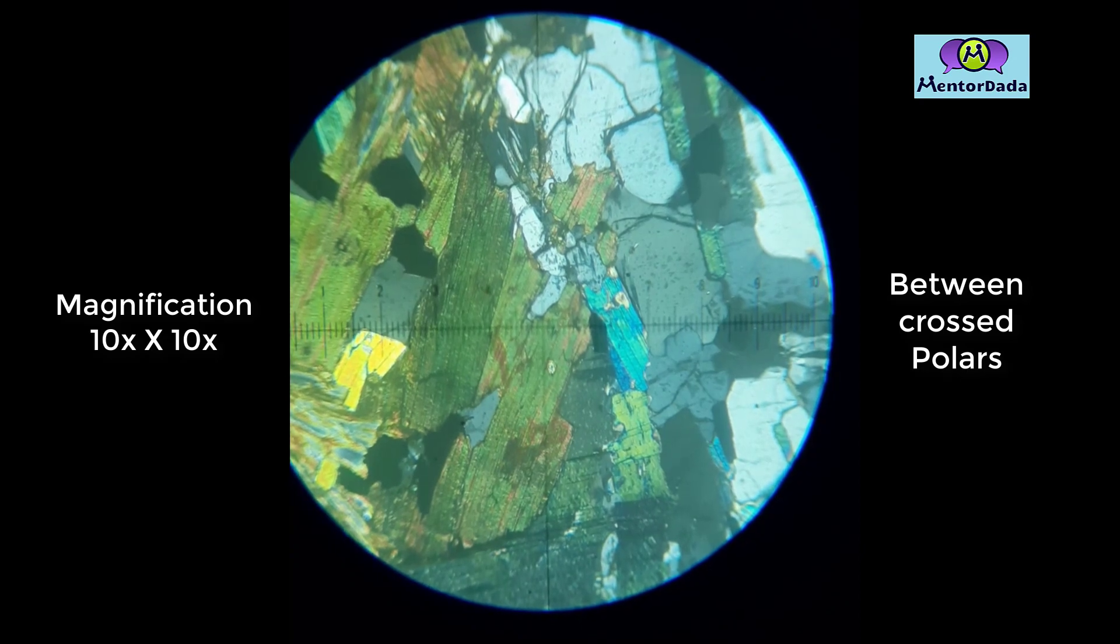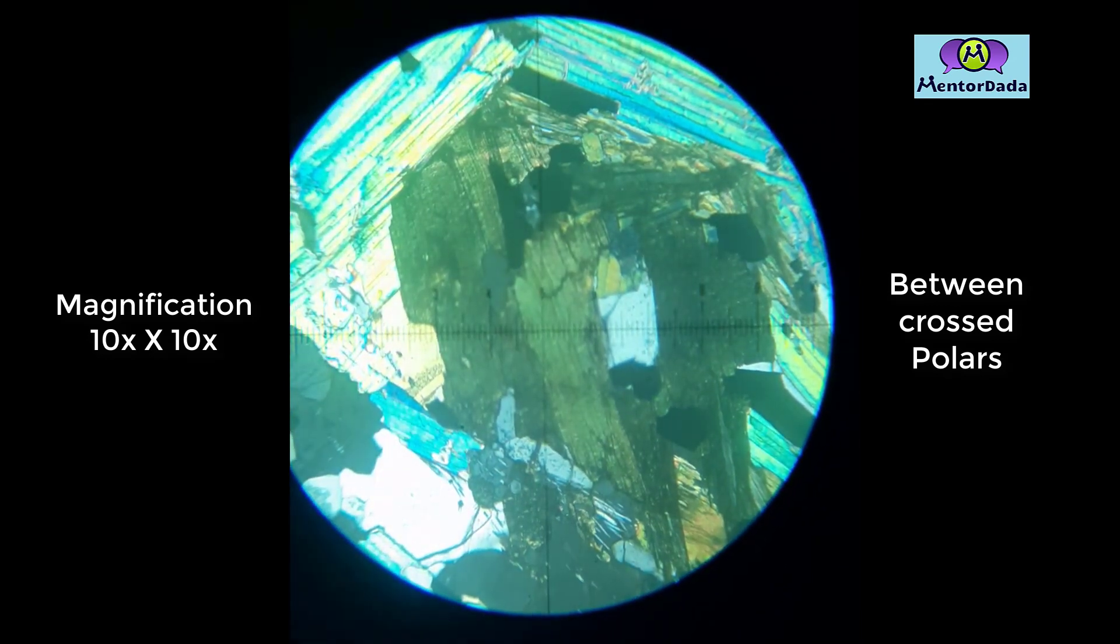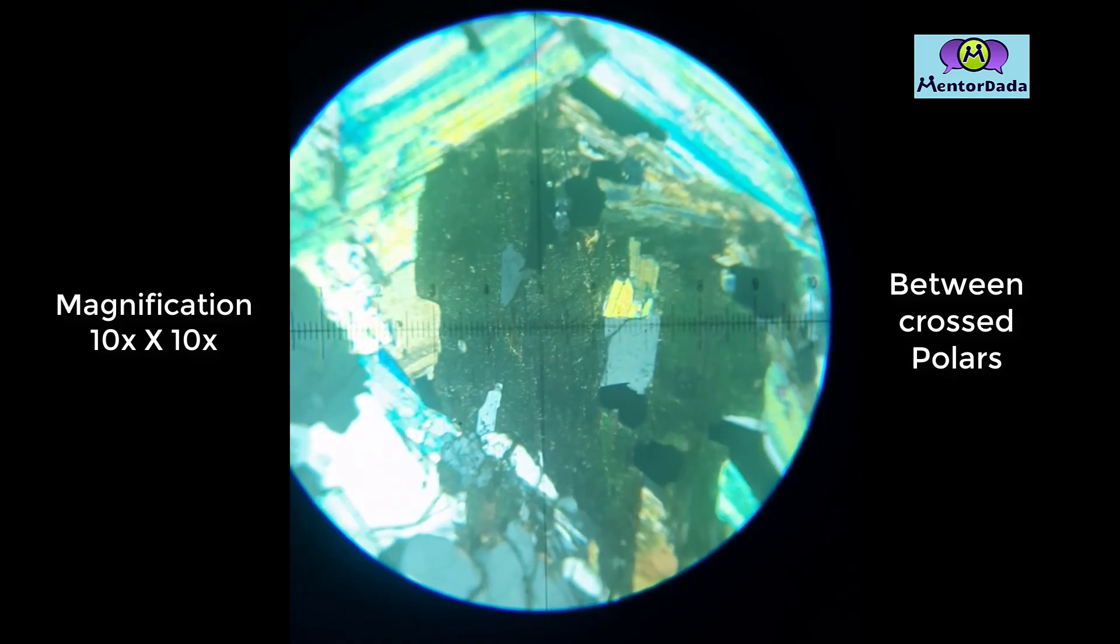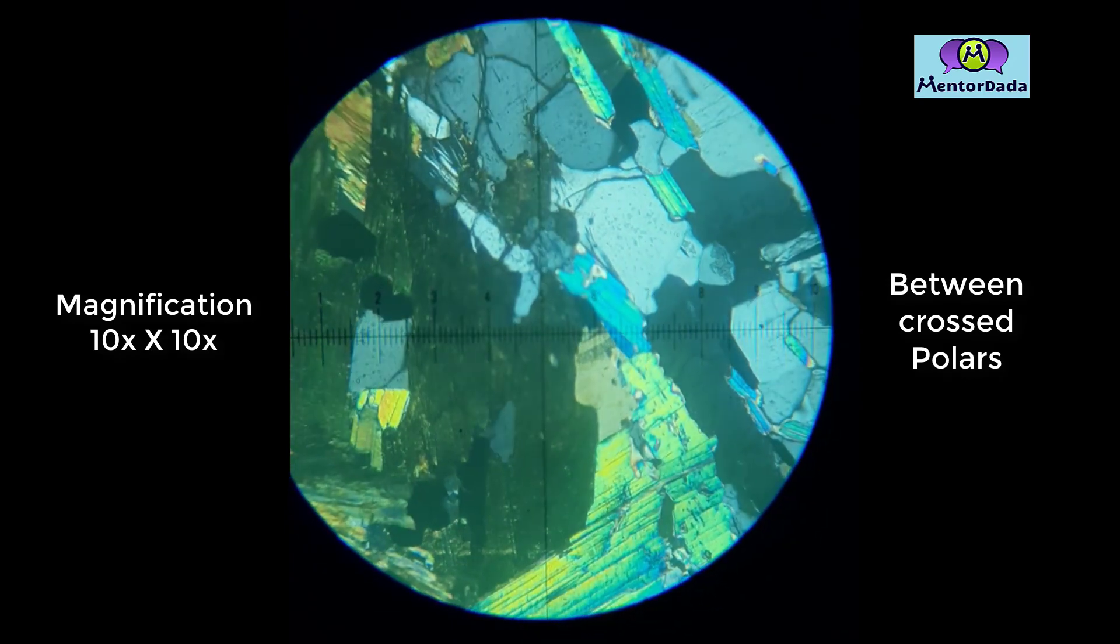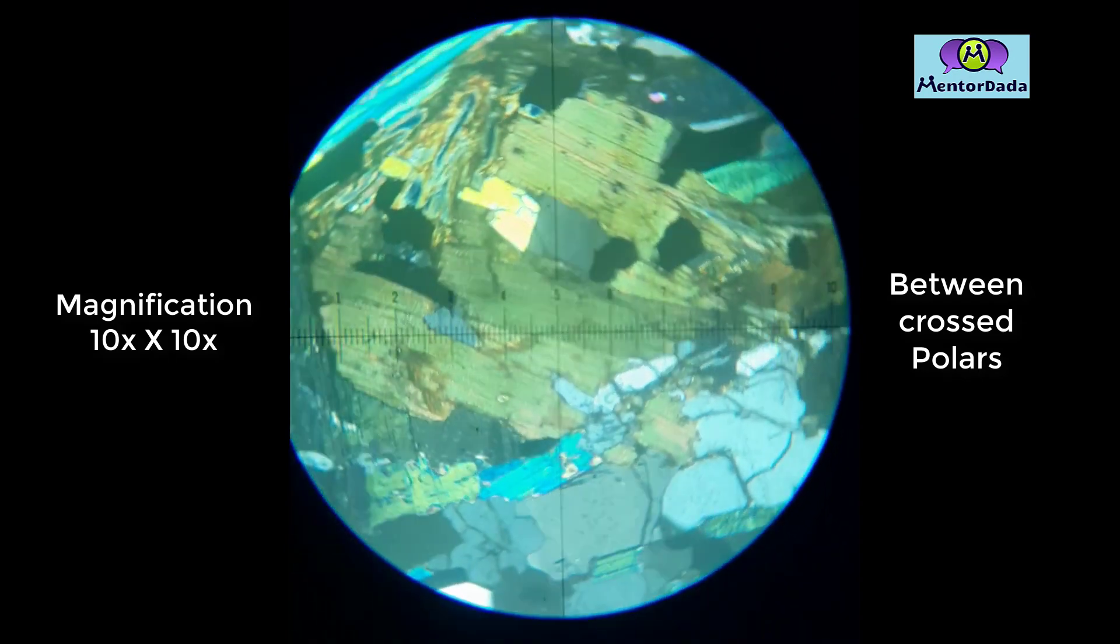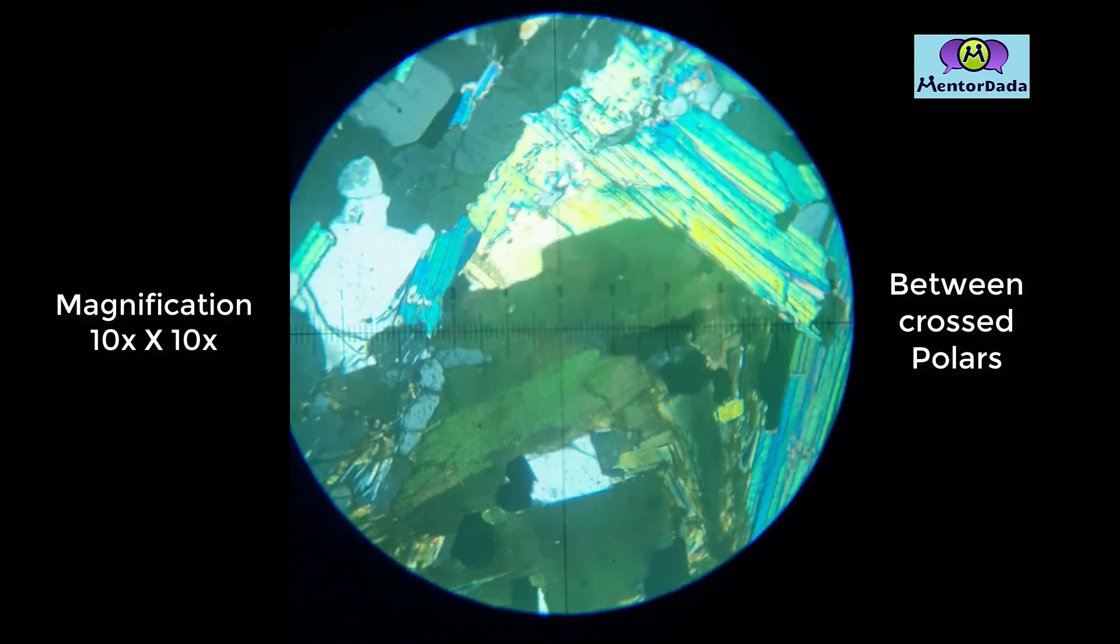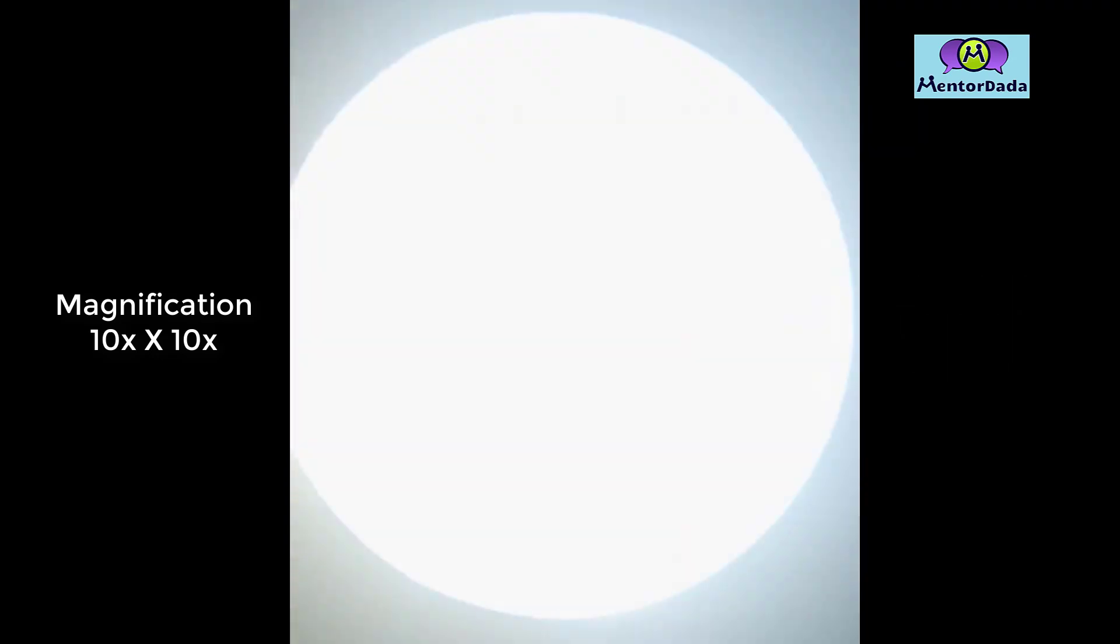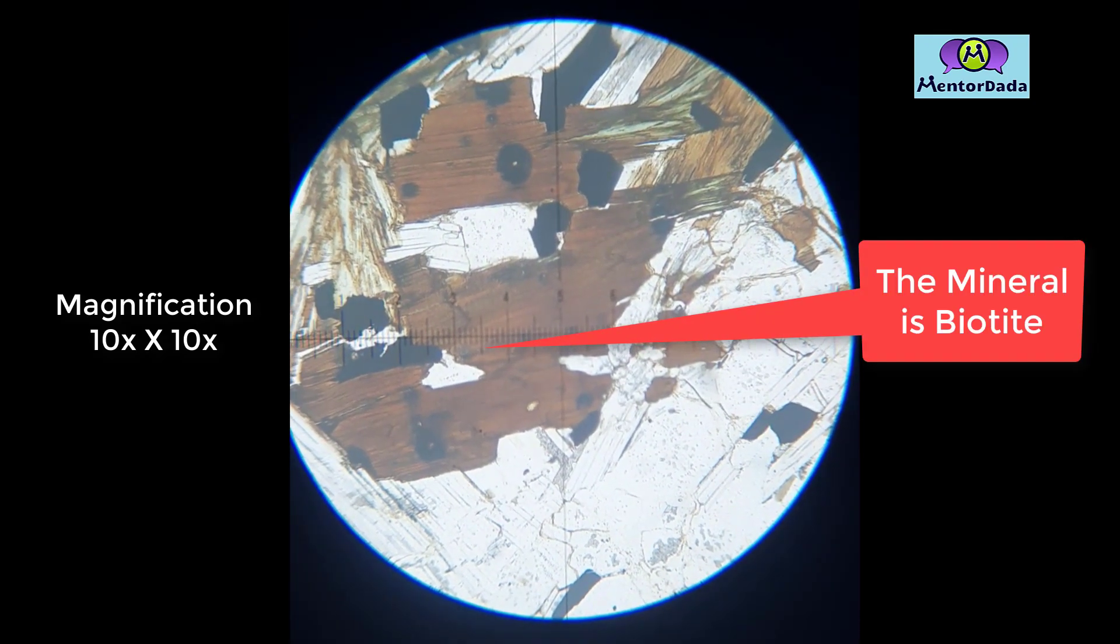Between crossed polars, the first thing we notice is the higher order interference color. Now if we align the cleavage parallel with any of the analyzer or polarizer's vibration direction, we can observe straight extinction. There is no twinning being observed here. Even in extinct position, we observe as if some light is peeping through small holes. That type of extinction condition is called mottled extinction. Hence, we can conclude this mineral to be biotite.